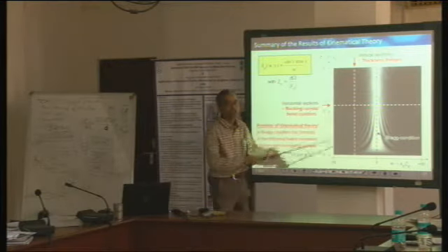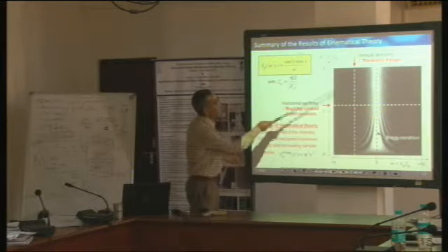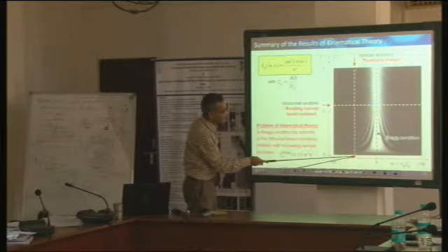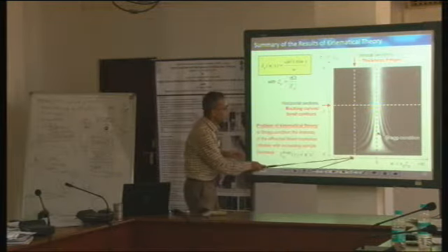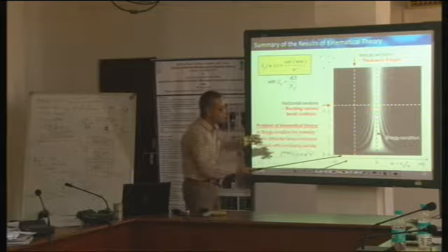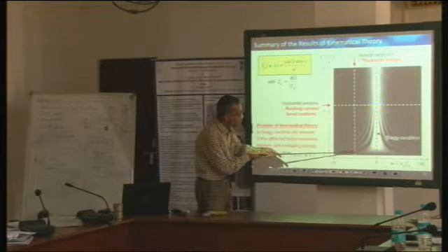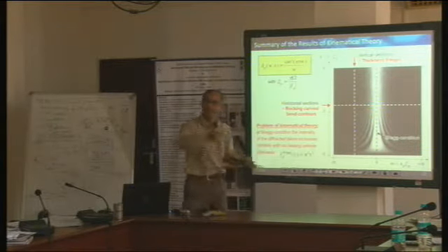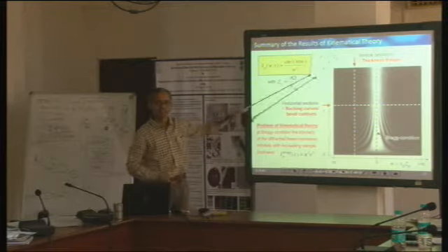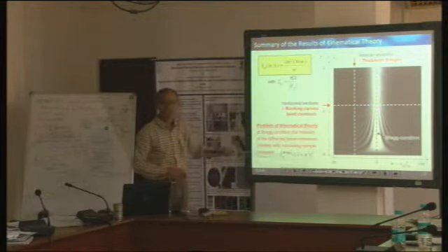We have to make our analysis or interpretation by traveling literally along this line, and we see that when S is not equal to 0, as we increase the thickness, our intensity will go, here for example, dark, bright, dark, bright, dark, bright, dark, like that. So we get fringes, and those are thickness fringes. This is what we also observe. So this makes more sense, correct?